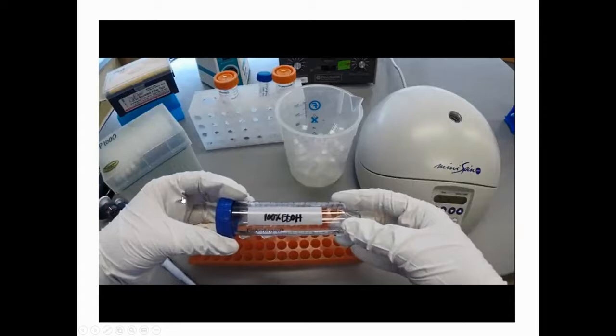They add the ethanol and salt directly in the cold temperature so that they can precipitate the DNA. That's the one method they chose. And of course, if you want even purer DNA, the best is to go through the phenol-chloroform extraction. The problem some people worry about is that those organic chemicals can contaminate the environment, so people try not to use phenol-chloroform. But personally, if you want pure DNA, you should use the phenol-chloroform extraction.